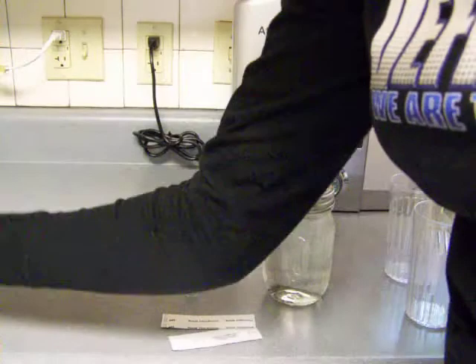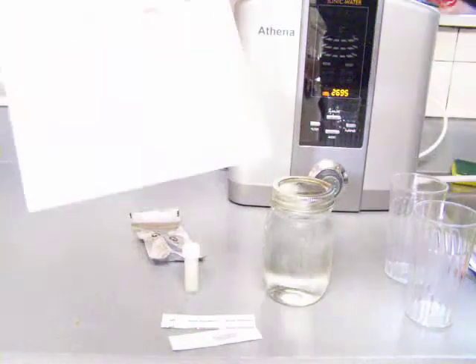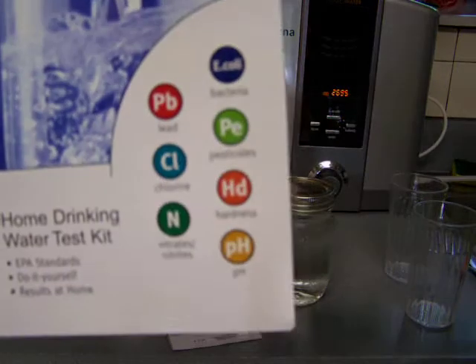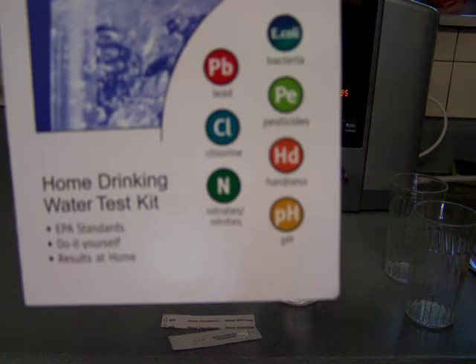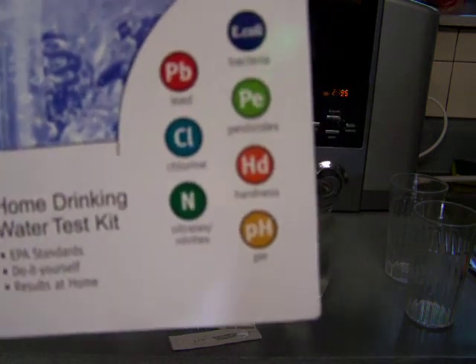So it says on the sheet, on the cover, it says that it tests for lead, bacteria, chlorine, pesticides, hardness, nitrates and nitrites, and the pH.